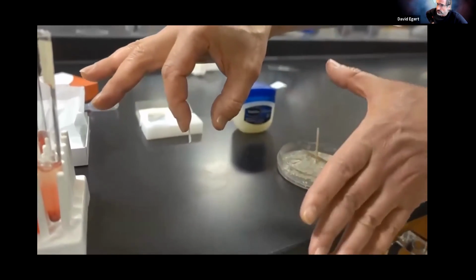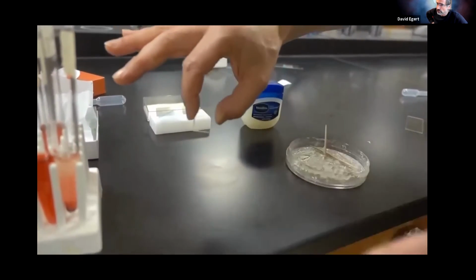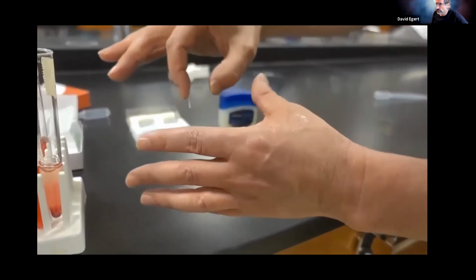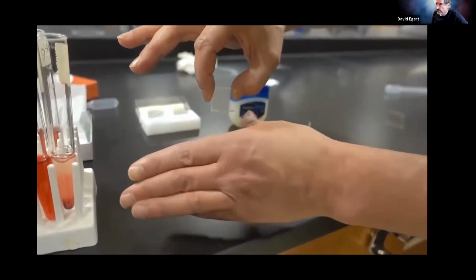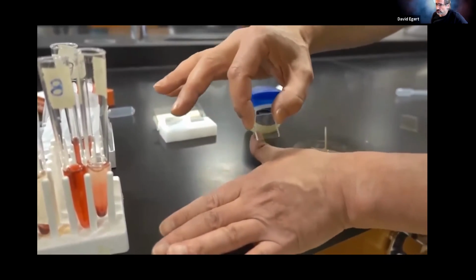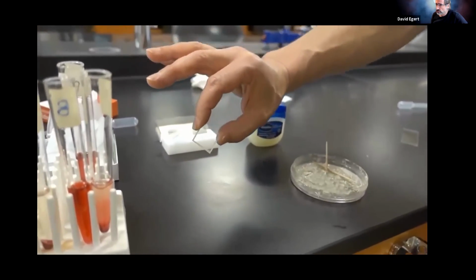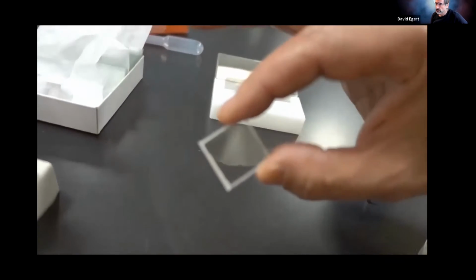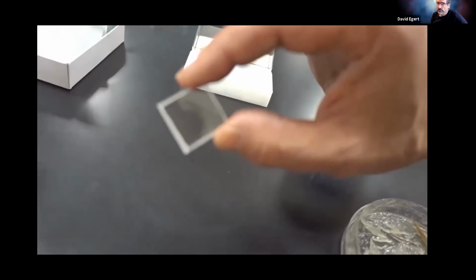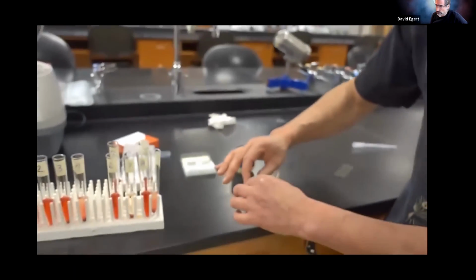And then rotate 90 degrees, go again. Now I have Vaseline on another side. Rotate it again 90 degrees. And Vaseline on 3 of the 4 sides. Again, 90 degrees. And I'm running out there. That's good. So here you have Vaseline on all 4 sides, kind of underneath, and it's going to make a nice gasket. When I put this down on top of my main slide, it's going to seal around the edges, and I can show you how that works right now.